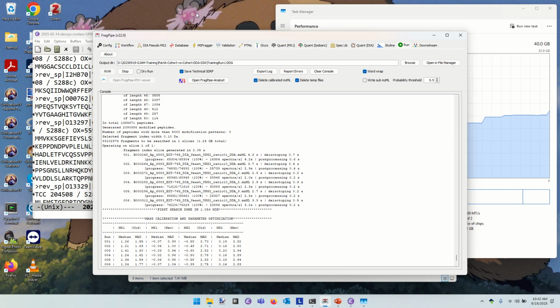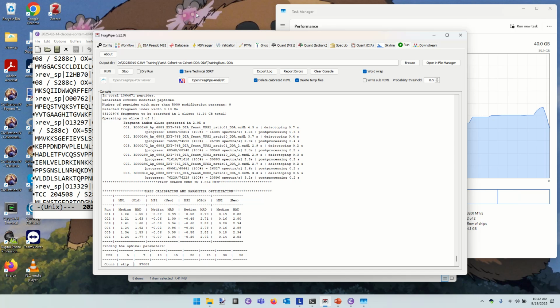In this case, we see that at base, we typically were about 1 and a bit ppm out of true on this data set, so it's able to correct that so that it's spot on. In some cases, you will find data that are up to 10 ppm out of calibration. If they're worse than that, the software will choke on it. Actually, it'll just say, "Forget this. I can't deal with it."